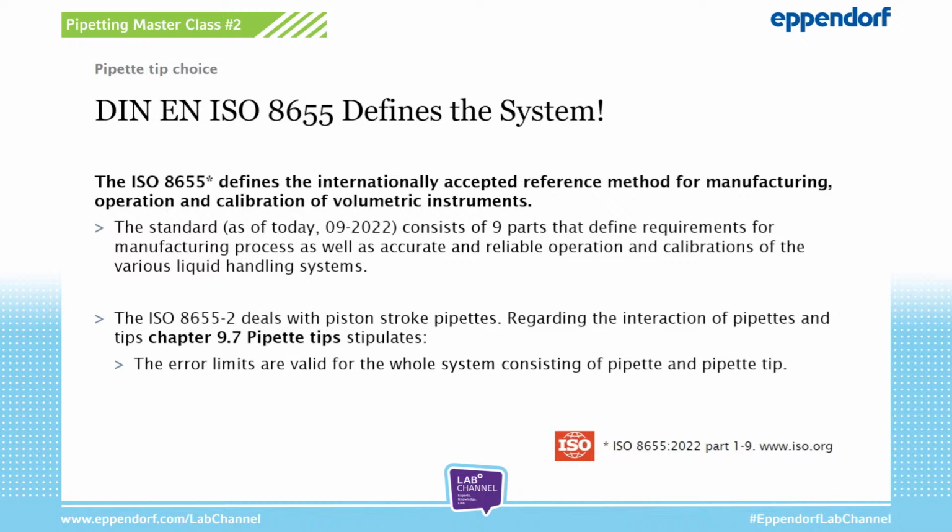This means if users apply a different pipette tip than the recommended one, they break the system. And this may have severe consequences on the data reproducibility. So system manufacturers like Eppendorf also sell some kind of security that the components of the system are of a design and quality which enables the system to perform within specified error tolerances, regardless of the tip batch.